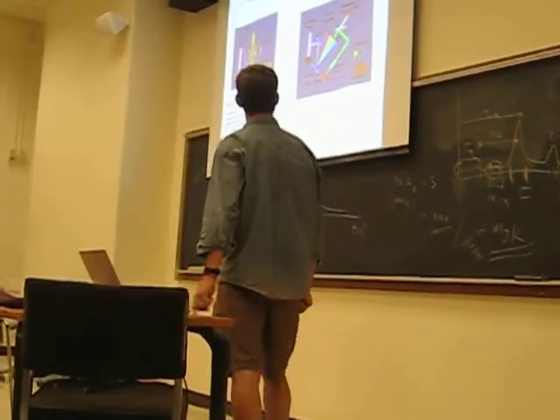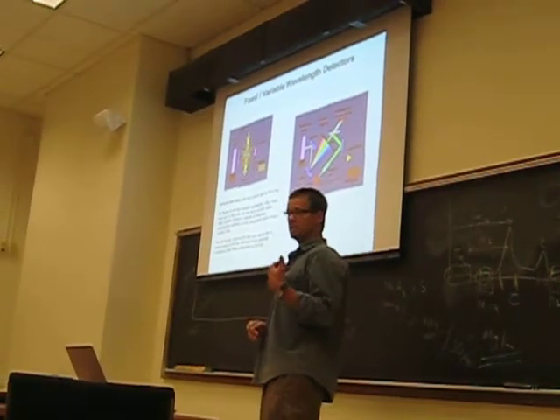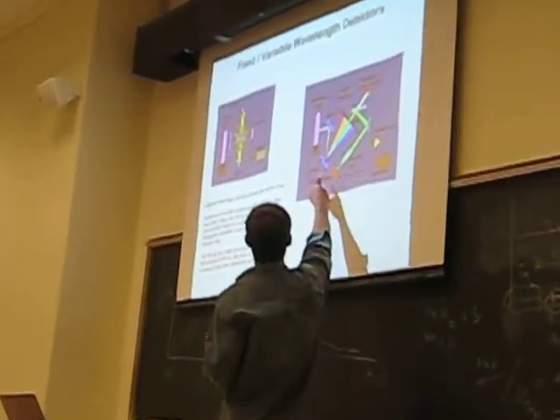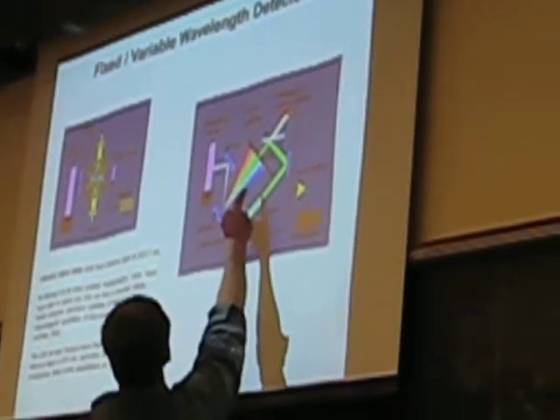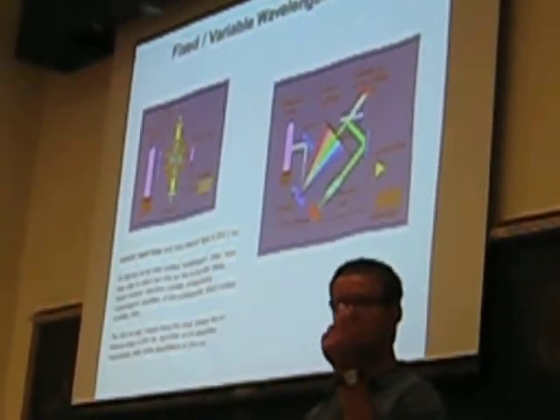I'll just quickly say, when we look at fixed and variable wavelength kinds of detectors in liquid chromatography, this is like what you've seen. You had a D2 lamp that was generating polychromatic light that was then going through a monochromator and a slit and selecting a particular wavelength, right? We've talked about that a lot.